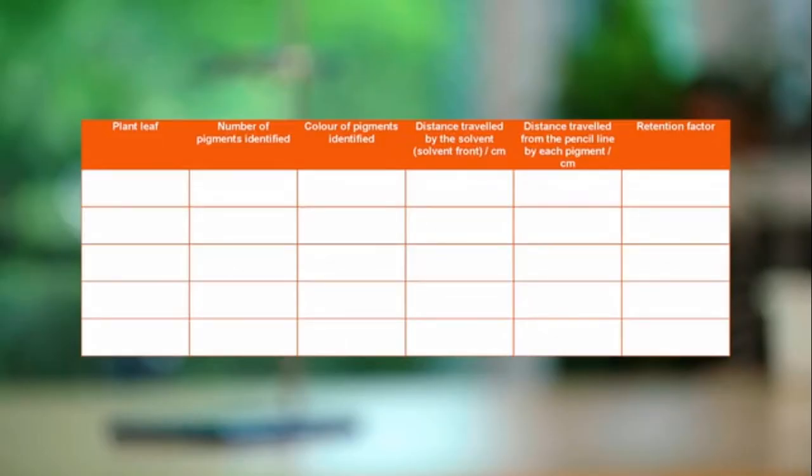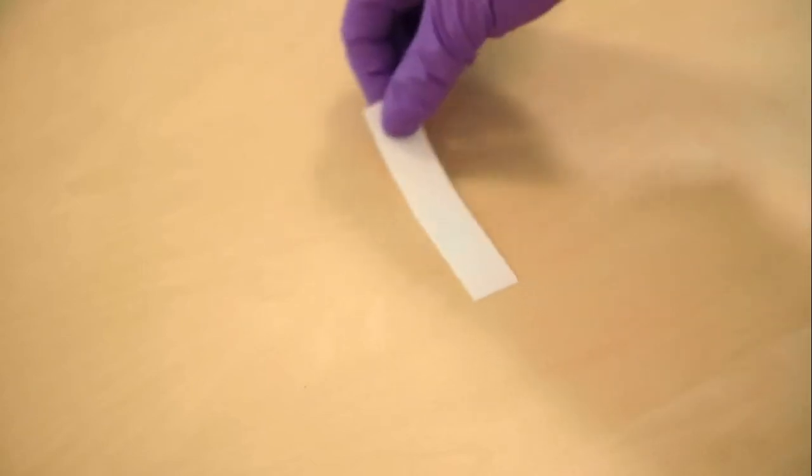A table like this one should be constructed for the results. First, a strip of chromatography paper is placed on a clean and dry flat surface.